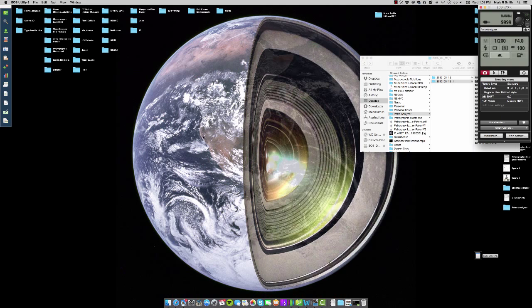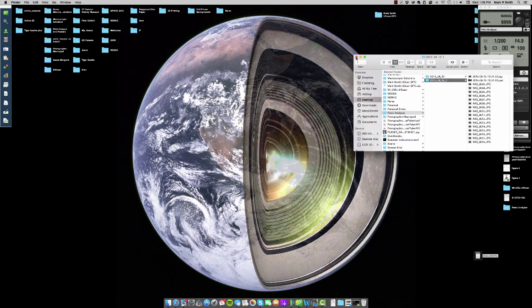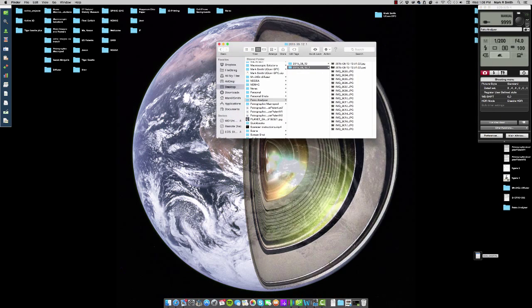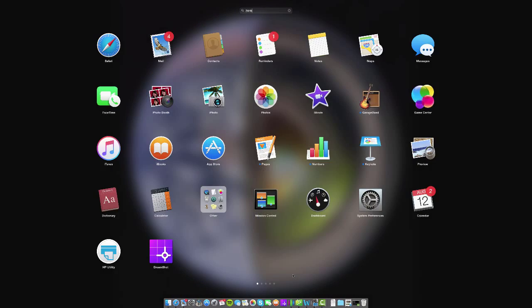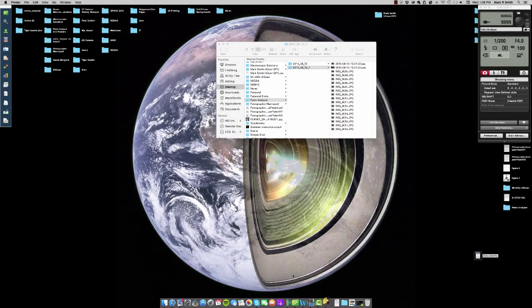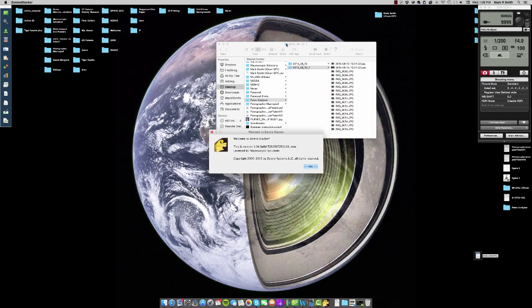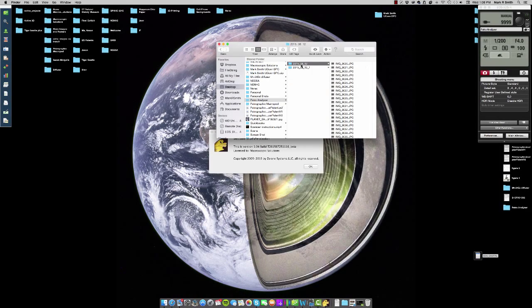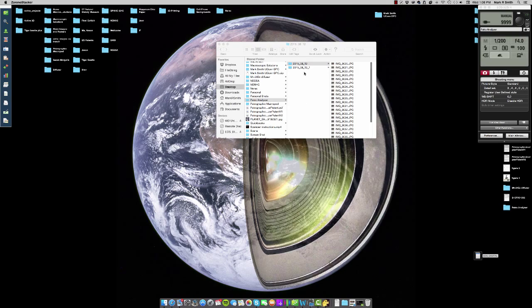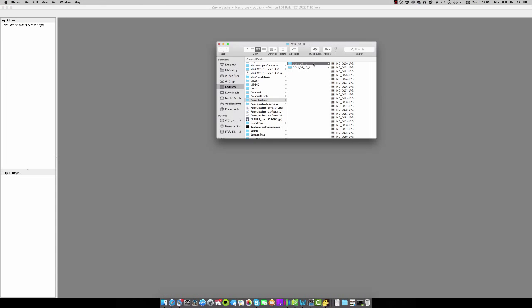You can even see some gunk there on the screen. Once I'm done doing that, what I'll do is I'll open up the software that we're going to use to stack these images. In this case, it'll be Zerene Stacker. I'm going to select my folder and I'm going to drag it to the input files section of this program.